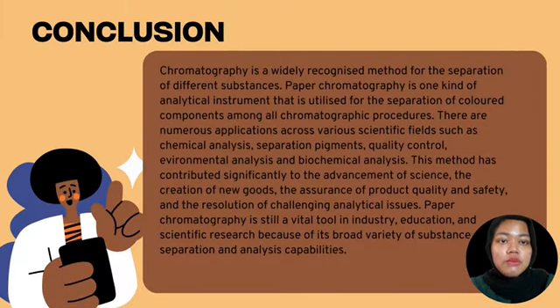Chromatography is a strong and adaptable analytical method that is applied in many scientific domains. It entails separating mixture constituents according to how differently they migrate through a porous paper matrix. Paper chromatography makes use of the concepts of adsorption, capillary action, and solvent interactions to enable the identification and measurement of various compounds in a sample.